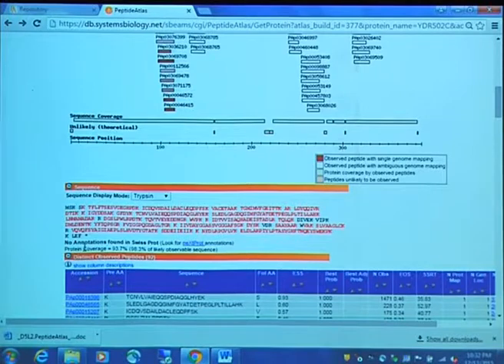So it's down at the bottom of this coverage plot, and it says 93.7% and 98.3 of the likely sequence. And what that means is these peptides that are considered unlikely are simply too short, or in some cases too long, to have been observed. And so really we have effectively 100% sequence coverage, or very close to it.